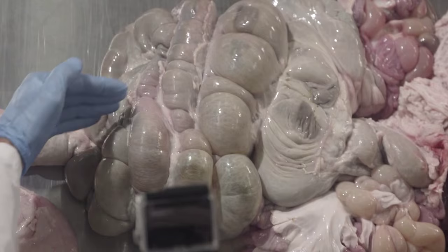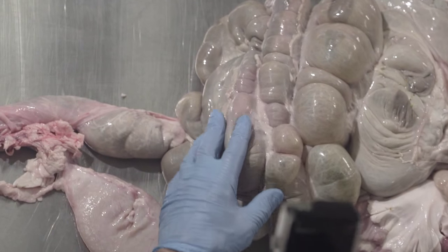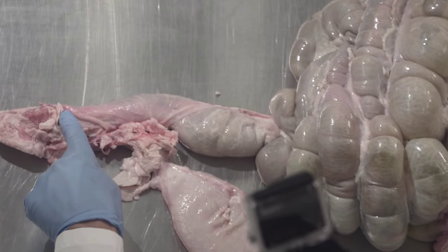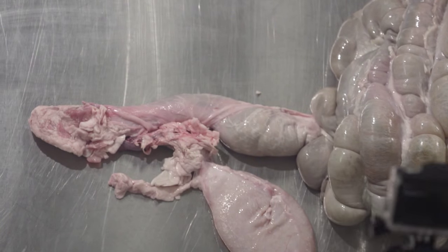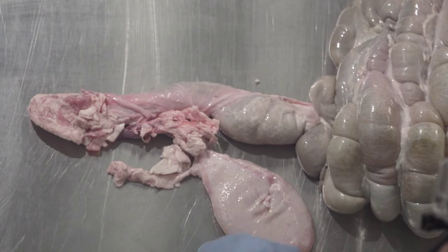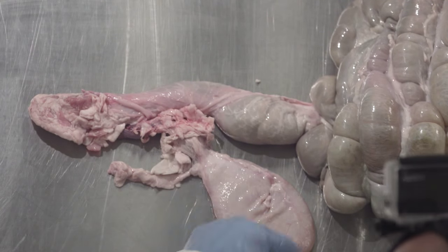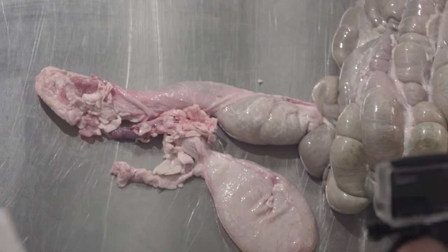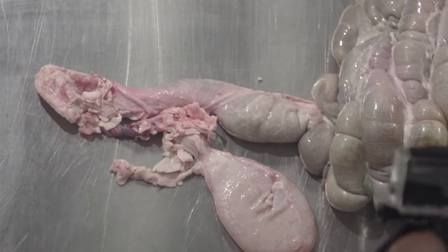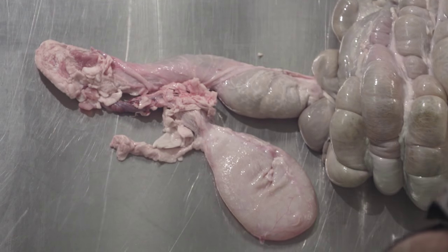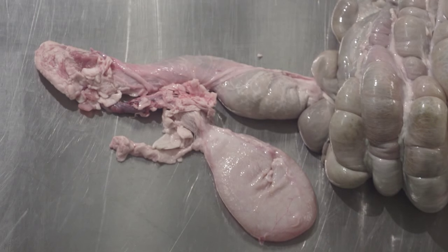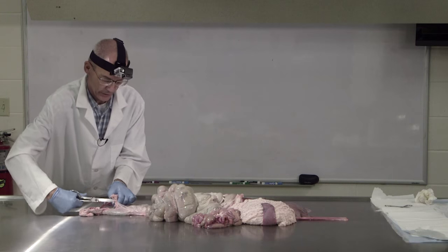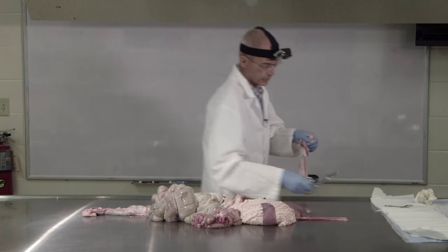The food material passes out of the large intestine into the rectum, and then out of the animal. The urinary bladder is also attached in this particular tract, but it has a separate opening for waste elimination. I'm going to remove the urinary bladder since it doesn't have any function for digestion.